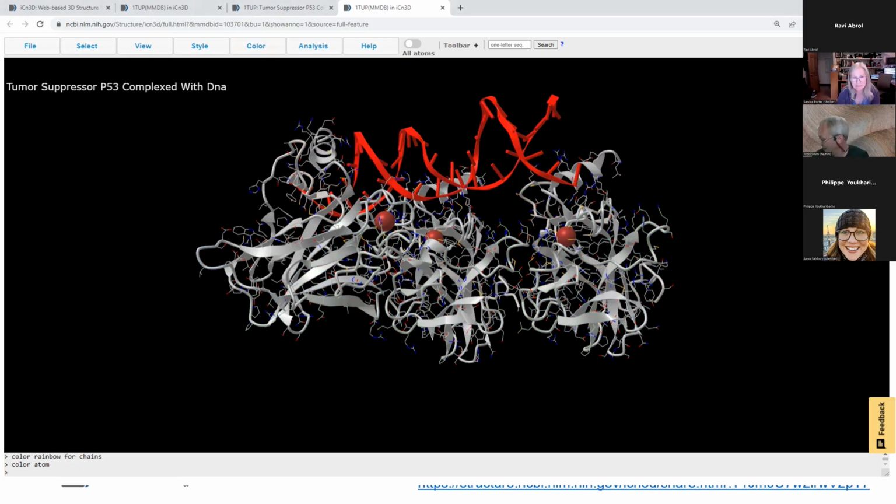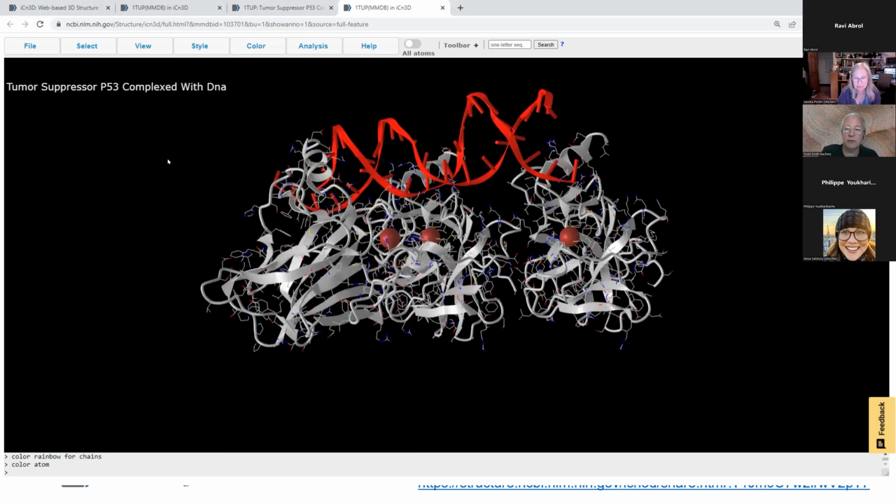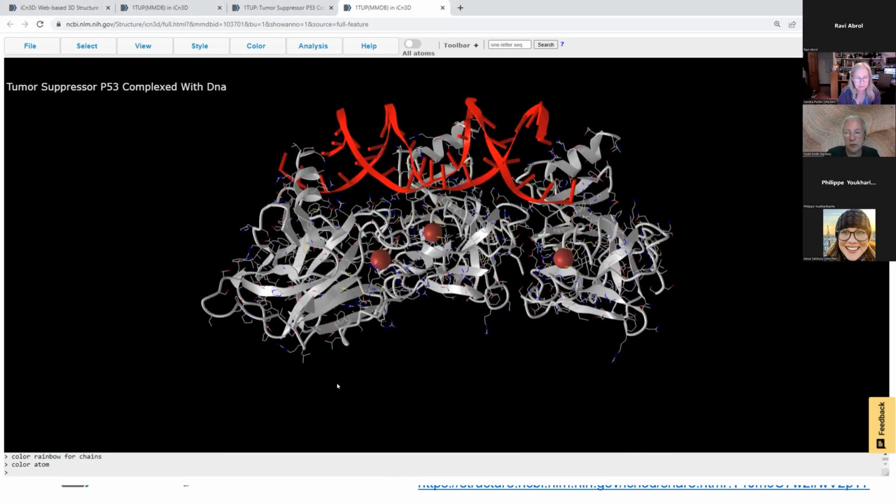What I would point to that is very interesting and important with this kind of coloring: yes, you should do it chain by chain or domain by domain, because then you learn how this folding goes on. It's very useful. But it can be a long debate about color, so let's stop here. I'm neutral on spectrum versus rainbow; having both is great. It's what you just said: chain by chain, domain by domain, because that conveys structural information and folding just using color to visualize it.